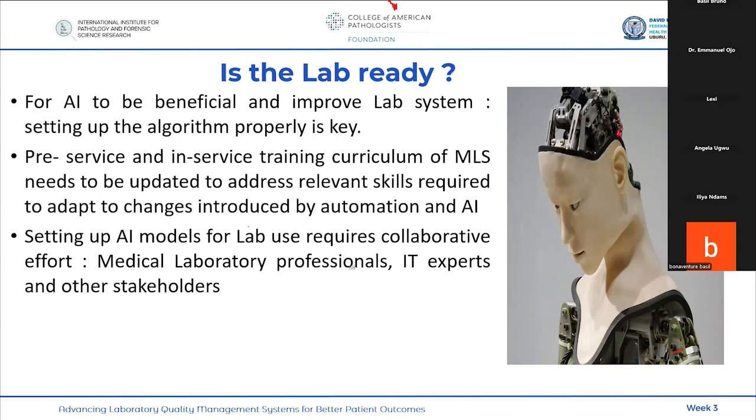So it is important at the point of installation, or even at the point management is negotiating for the suitable LIMS for the system, that we work with them and see that what is actually going to be used as LIMS will respond to the need of the lab. So we should not stay back.